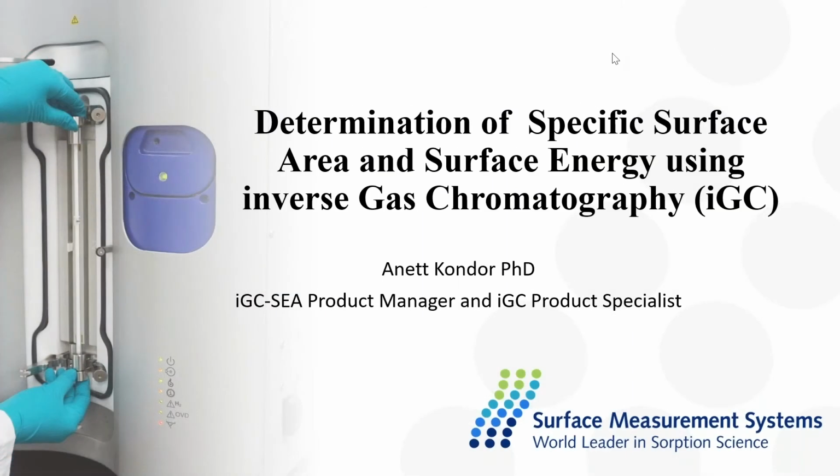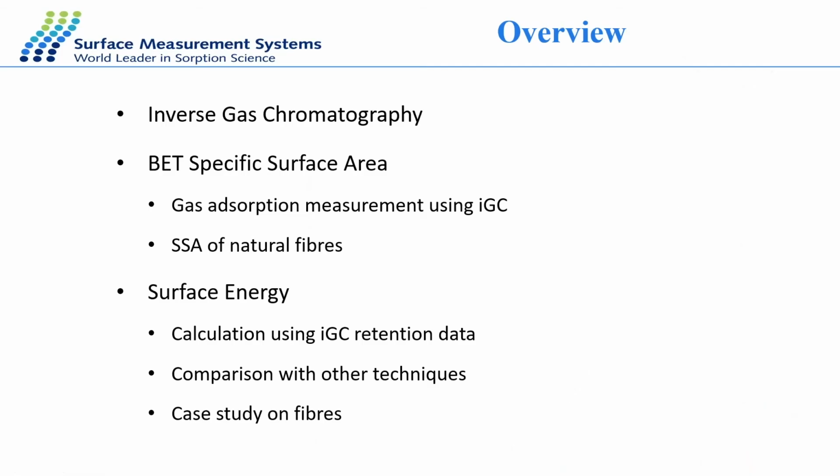Today's webinar is about determination of specific surface area and surface energy using inverse gas chromatography. So first, I will just introduce the technique, and I will talk about then the BET surface area analysis using IGC with an example on natural fibers. And then I will go through the determination of surface energy using IGC technique. And I hope we'll have time to show you an example on this as well, on a fiber.